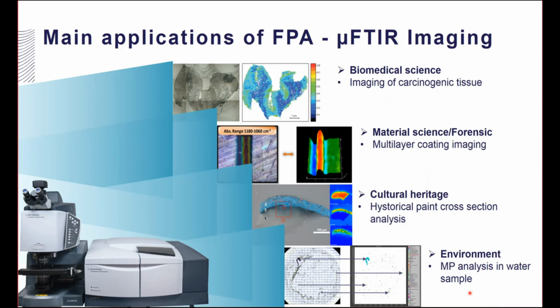After that, I will quickly go through the main applications of FPA micro-FTIR imaging, which is widely used in several research areas, from biomedical science to material science and forensics, to cultural heritage analysis, and more and more in environmental analysis.